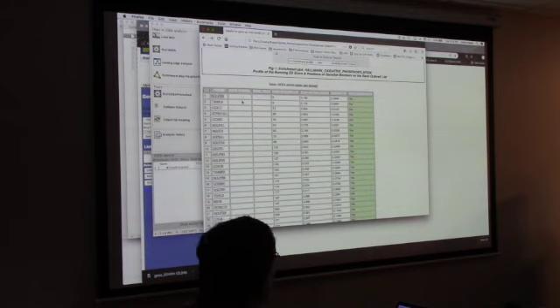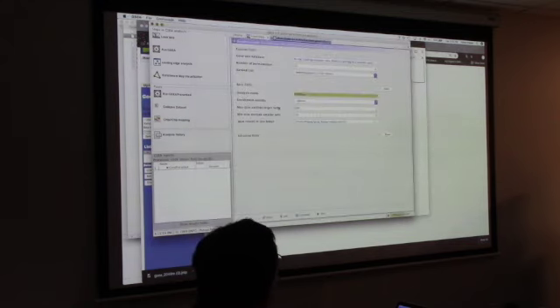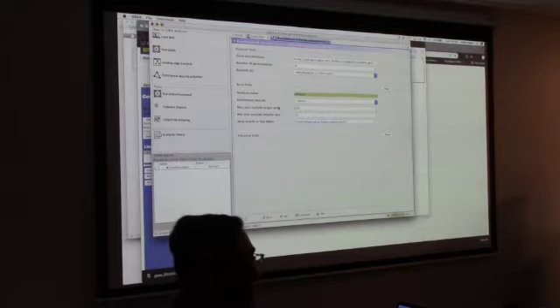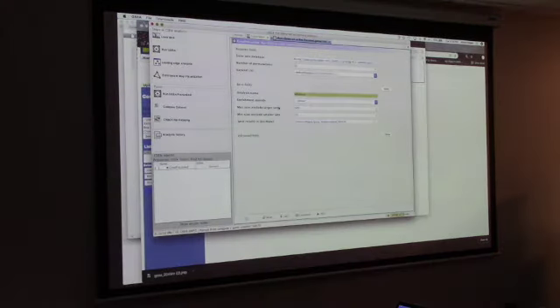Okay, that's pretty much GSEA. It's not very complex. The part that I unfortunately cannot explain to you is the biological insights part, which is where you have to come back to me and tell me what you find. All right, and let me know if anything interesting comes up in this gene set, because it shouldn't, because this is just random.